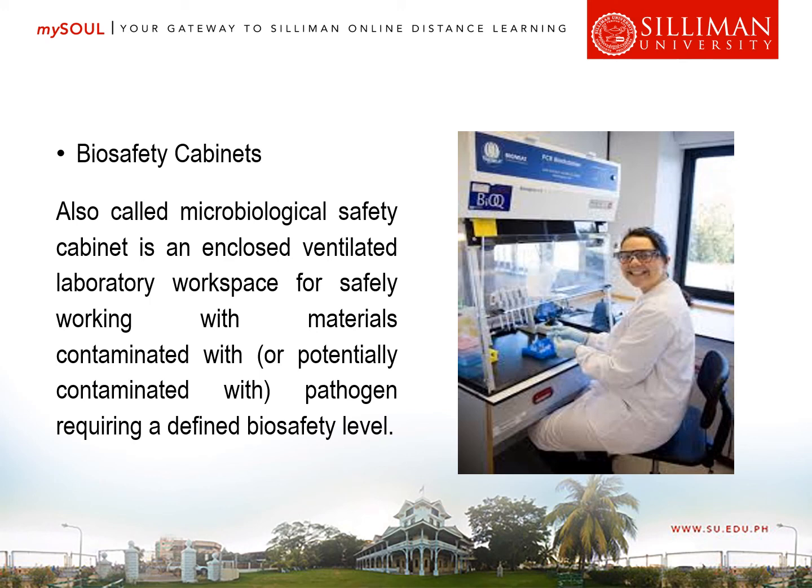Okay, our biosafety cabinets are also known as our microbiological safety cabinet, which is an enclosed ventilated laboratory workspace for safely working with materials contaminated with pathogen requiring a defined biosafety level. So don't worry, because there is a separate lesson for the biosafety cabinets, because biosafety cabinets have four types or four levels that we need to know, and our microorganisms will be processed depending on the kind of biosafety level it requires. Okay, so that's the purpose of our biosafety cabinets.